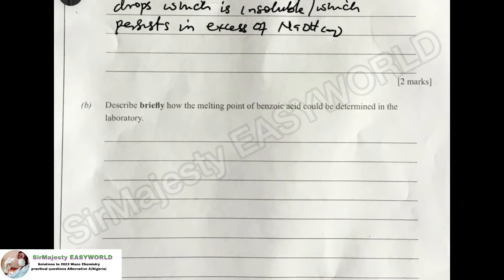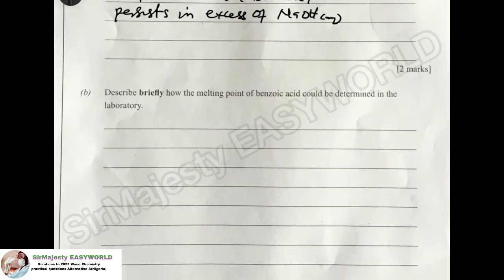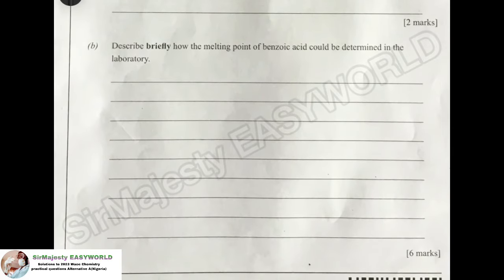So we move over. Describe briefly how the melting point of benzoic acid could be determined in the laboratory. This is applicable to determination of the melting point of solids. First of all, you need to heat, most times in a capillary tube. You heat it with a gentle heat using a thermometer. So here you must mention heat the solid benzoic acid in a capillary tube, with the thermometer fixed.